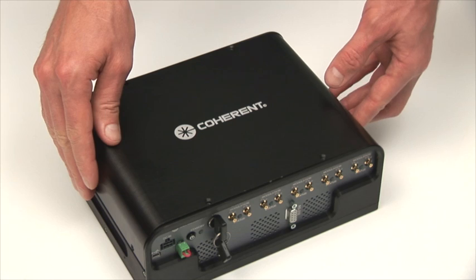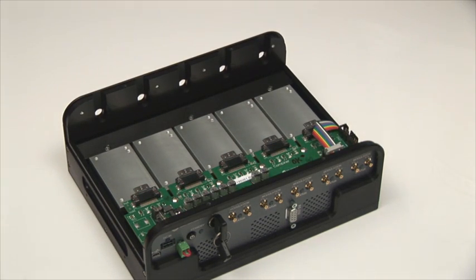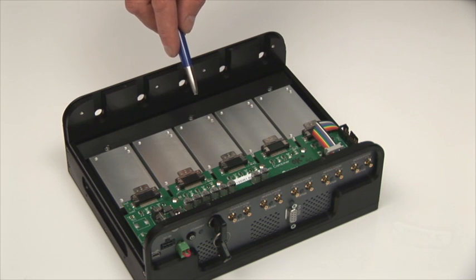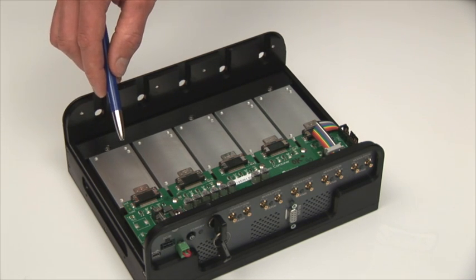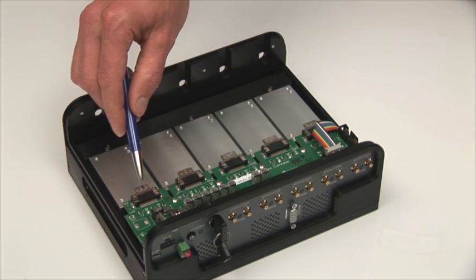Inside the OBIS laser box, by removing eight screws, the cover can be removed. You can see five separate heat sinks for the OBIS lasers — one, two, three, four, and five separate heat sinks to mount the OBIS laser directly onto. To connect power and all the communication signals to the laser, there are five separate SDR connectors.